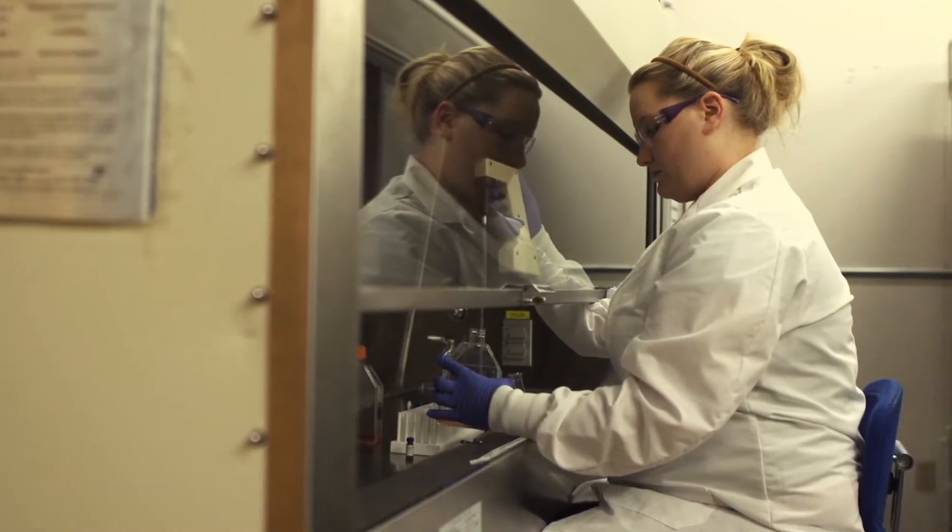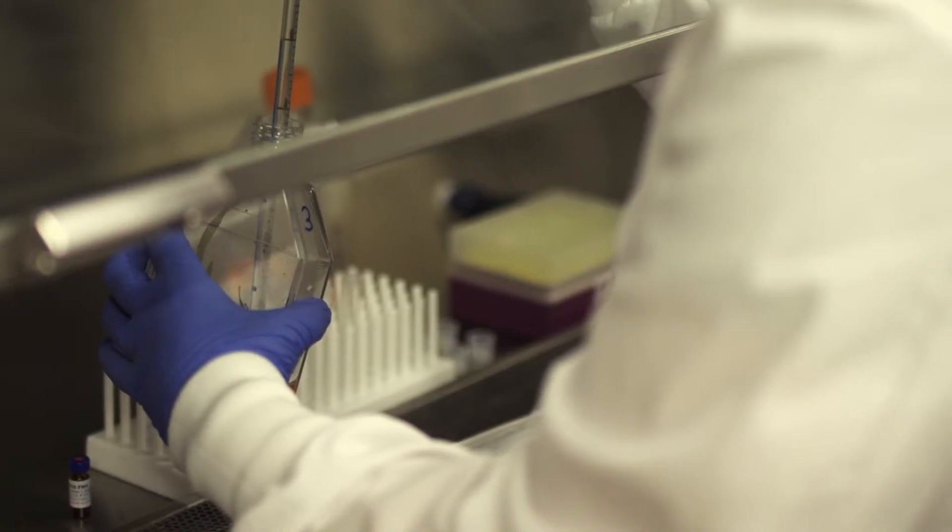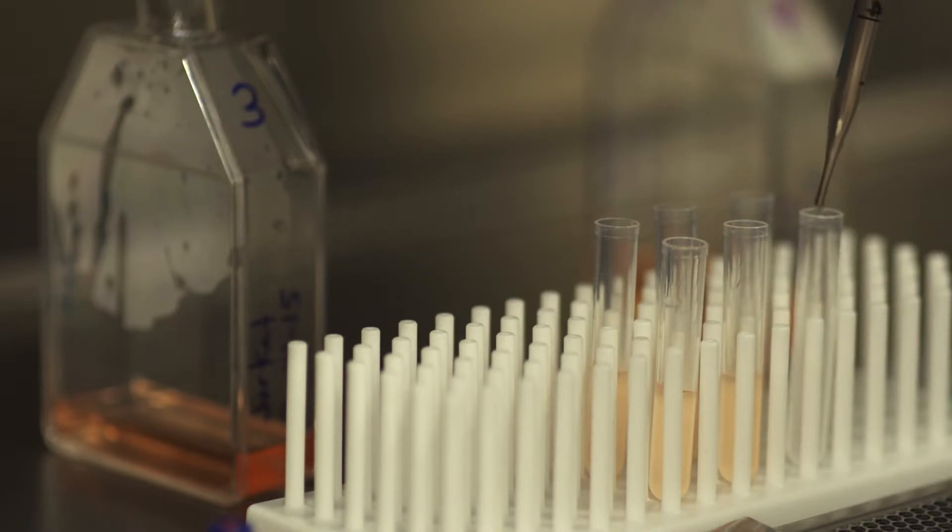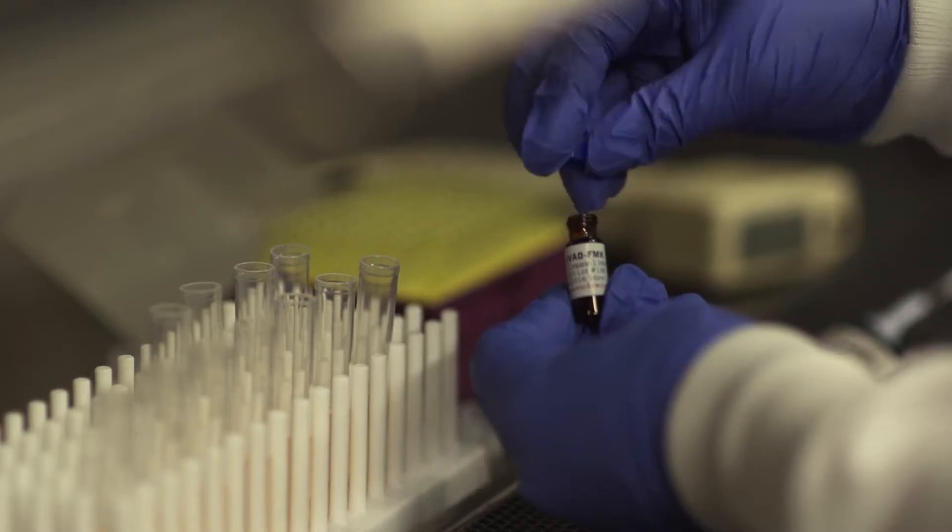To use FLICA, first grow your cells to your target concentration. These cells can be in suspension, adherent, thin tissue sections, or frozen sections. Then expose your cells to the experimental conditions and induce your positive control with staurosporine or camptothecin.